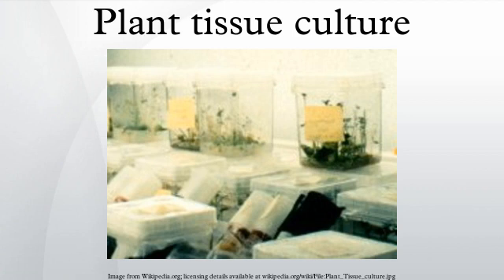Techniques. Modern plant tissue culture is performed under aseptic conditions under HEPA-filtered air provided by a laminar flow cabinet. Living plant materials from the environment are naturally contaminated on their surfaces with microorganisms, so surface sterilization of starting material with chemical solutions, usually alcohol and sodium or calcium hypochlorite or mercuric chloride, is required. Mercuric chloride is seldom used as a plant sterilant today, unless other sterilizing agents are found to be ineffective, as it is dangerous to use, and is difficult to dispose of.